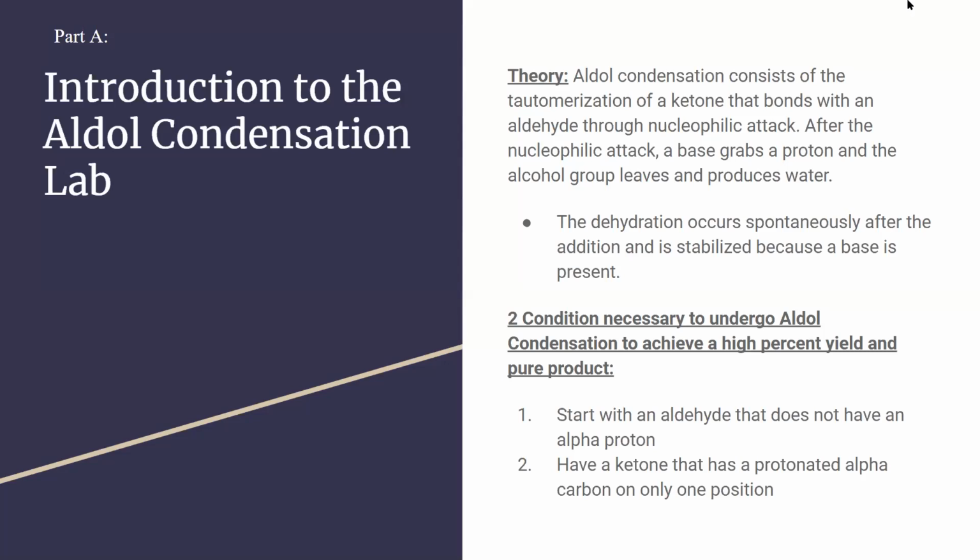So the theory for this lab is an aldol condensation that consists of tautomerization of a ketone that bonds with an aldehyde through nucleophilic attack. After the nucleophilic attack, a base grabs a proton and the alcohol group leaves and produces water. The dehydration occurs spontaneously after the addition and is stabilized because the base is present.